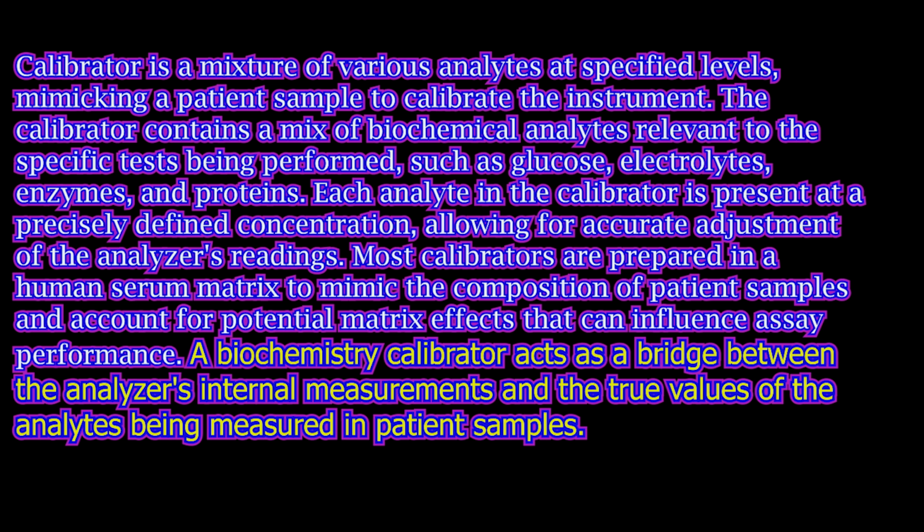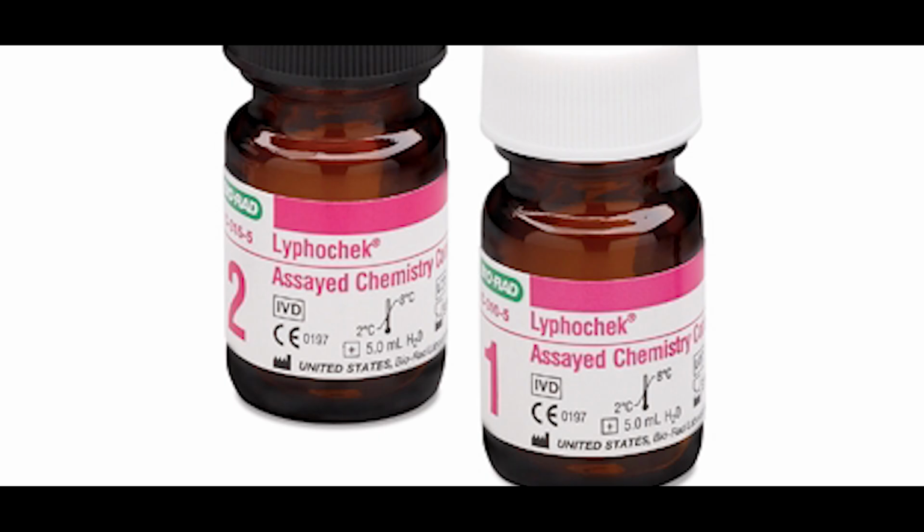to the standard solutions. Calibrators are prepared in a similar matrix to the samples that affect instrument response and minimize the major source of errors. Calibrators are traceable to known standards, having a high level of accuracy and comparability of results across different labs and different instruments. Calibrators provide a more accurate and reliable way to establish the relationship between instrument response and analyte concentration, especially when dealing with complex samples.